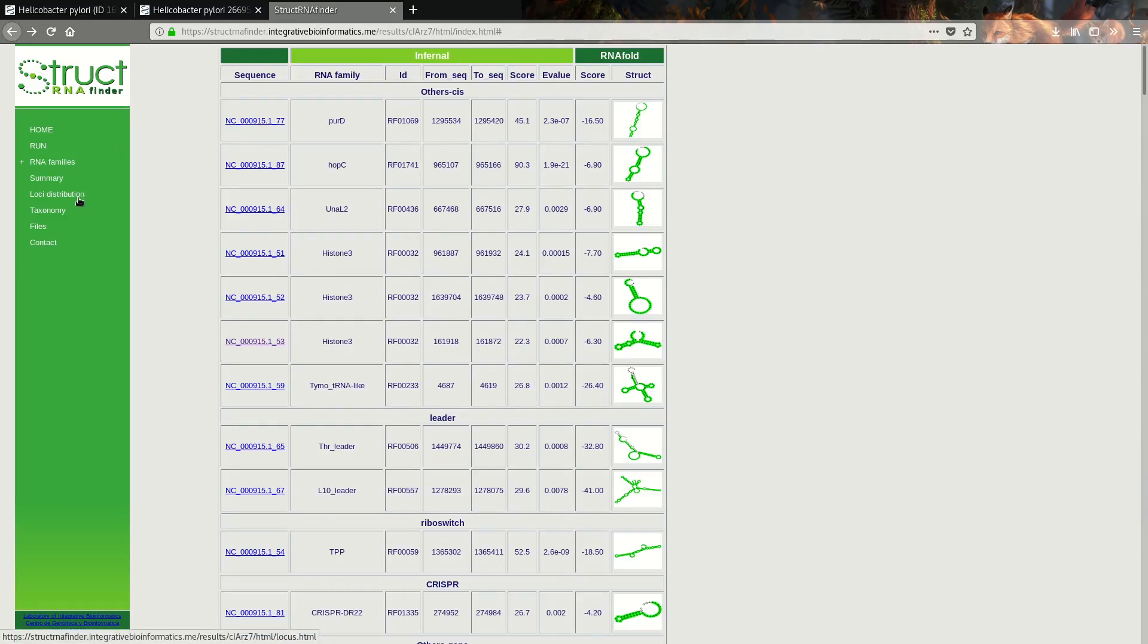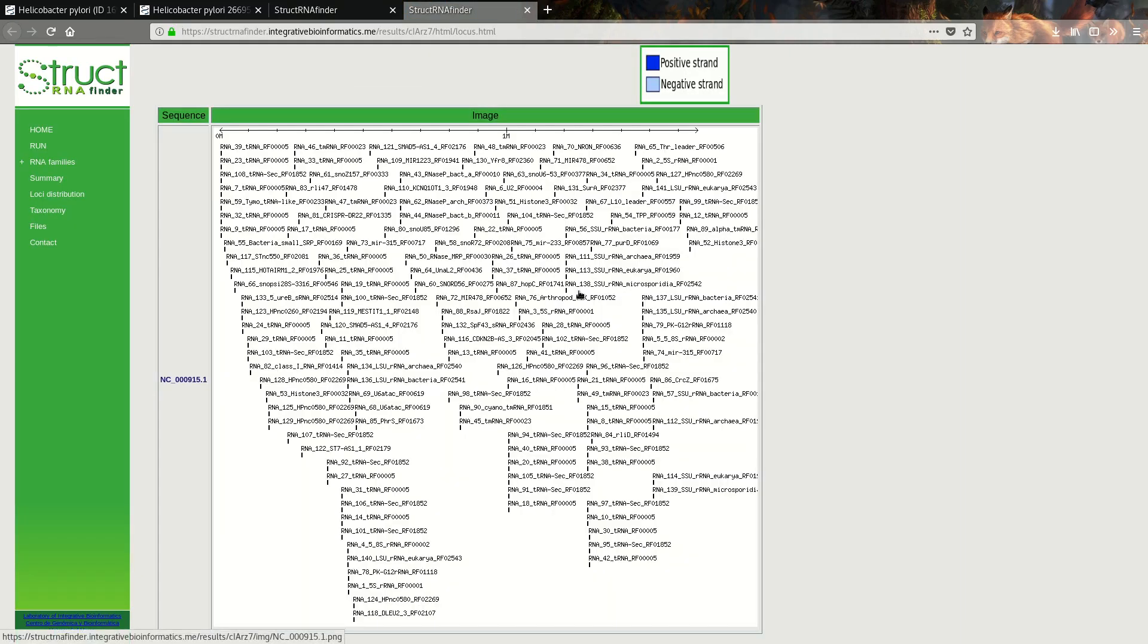Next, if you want to know where on the genome these are located, we can look at sequence numbers, but they're very big and don't indicate what is close to each other. We can go to loci distribution to see how they're located on the genome from nucleotide zero to the end. Every bar is an RNA. Because this genome is so large, we can't see if it's on the positive or negative strand - the blocks are too small, just looking like a black line.